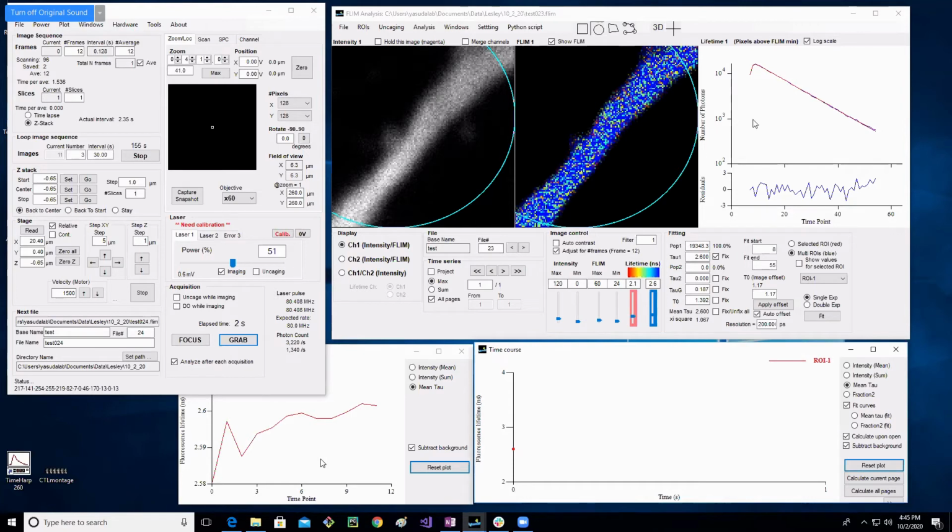When you take an image, of course, a beautiful light center or no light center, depending on how many photons you have. How many photons do you need for an experiment? Well, there's no set value, but I will tell you my experience. If you're in the 10 to the 4th range, your error will be like 1% or so. Very nice.